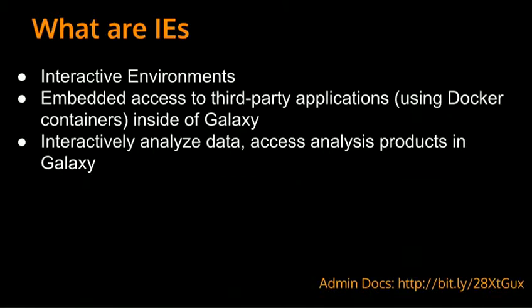So our idea was to integrate such an interactive analysis workbench in Galaxy directly. Our first idea was IPython, so at that point it was still called IPython. But then quickly we iterated over RStudio, nowadays it's Jupyter, but it's the same concept.